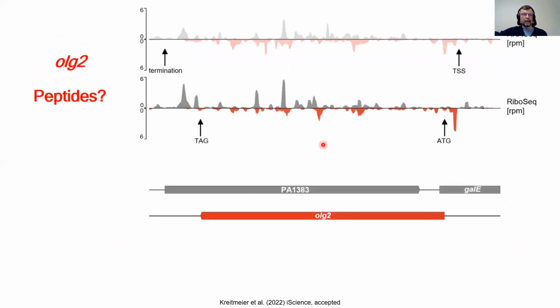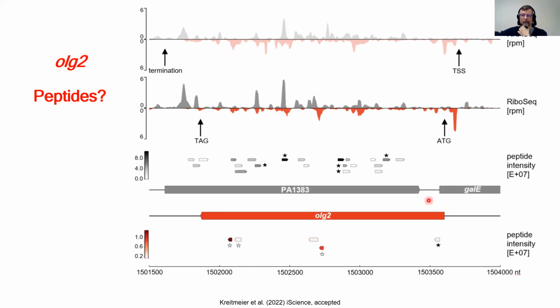Cool. Okay, same for overlapping gene 2. You've seen this picture already. So a lot of peptides for the annotated gene. Some were picked for PRM. And here, overlapping gene 2, we also picked some. And yeah, well, it wasn't as good as we expected, but at least 1 peptide we could verify, right?